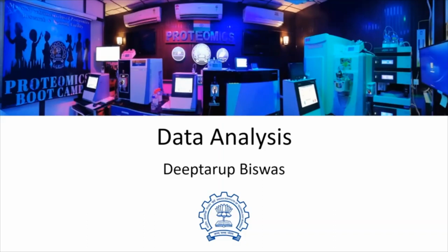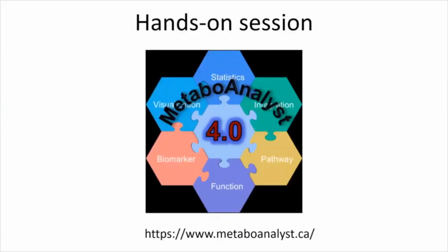output file looks, and it contains a number of columns. So once you have cleaned up that particular messy data, and finally you have got the P cross N matrix, where you have the protein names in column A, and all the LFQ intensities in the next columns, then we are ready to go ahead with the next part of the analysis, which is the secondary analysis part after the MaxQuant analysis, right?